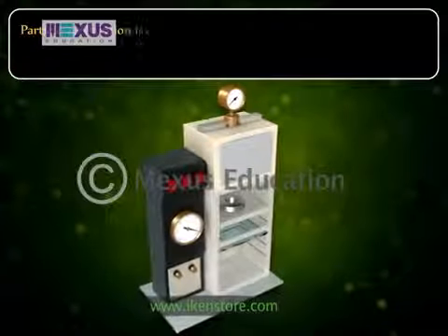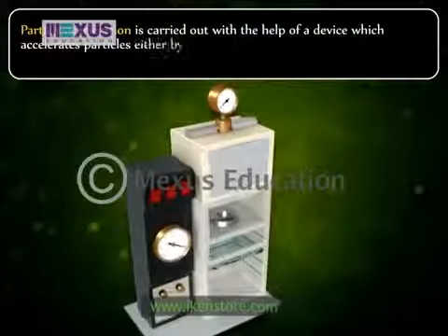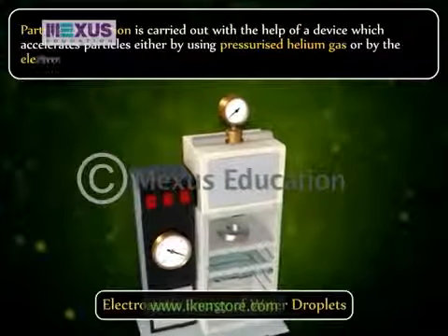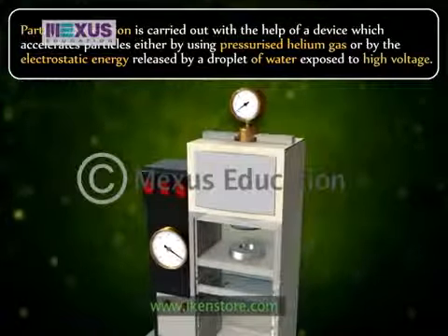Particle acceleration is carried out with the help of a device which accelerates particles either by using pressurized helium gas or by the electrostatic energy released by a droplet of water exposed to high voltage.